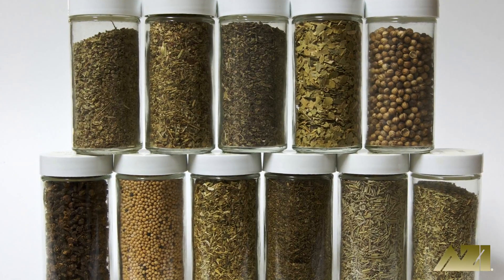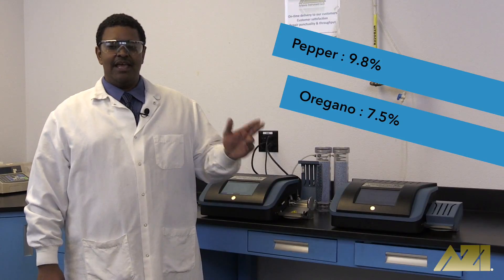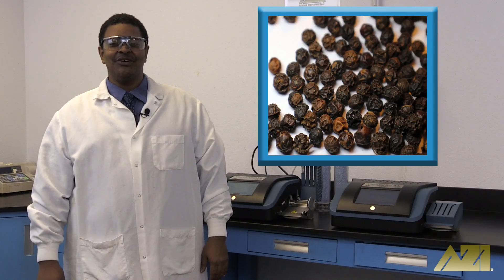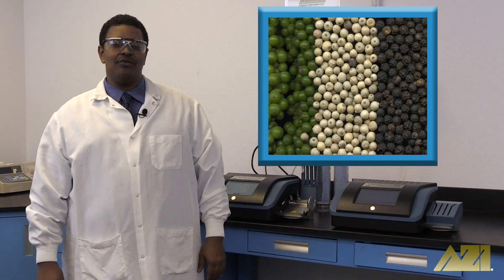Certain types of packaging can also help increase shelf life by preventing moisture contamination. As you can see, the pepper has approximately two percent more moisture than the oregano. This could be because the black pepper is harder to dry out — there's a skin of sorts from the peppercorn fruit that allows for more moisture to be trapped within the pepper when it's initially dried as a whole peppercorn.